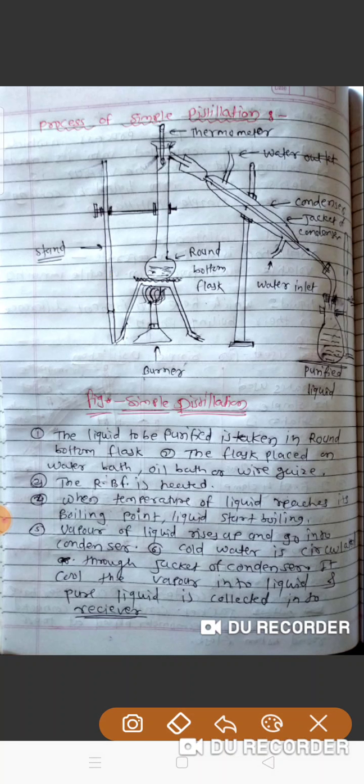The vapor rises up and enters the condenser. The jacket of the condenser is circulated by cold water, and this cold water cools the vapors and condenses them into liquid, and pure liquid is collected in the receiver. This is the process of simple distillation.